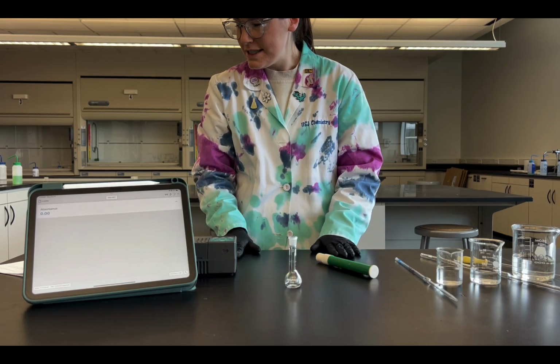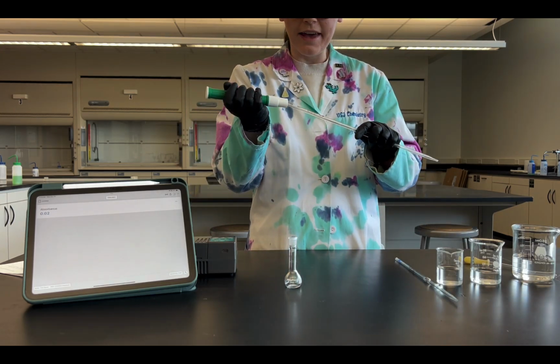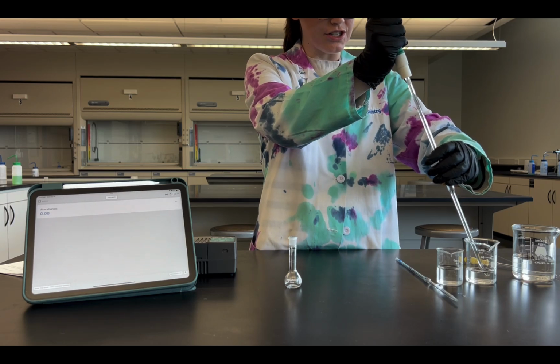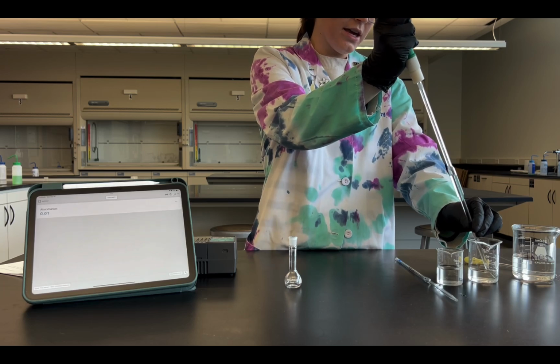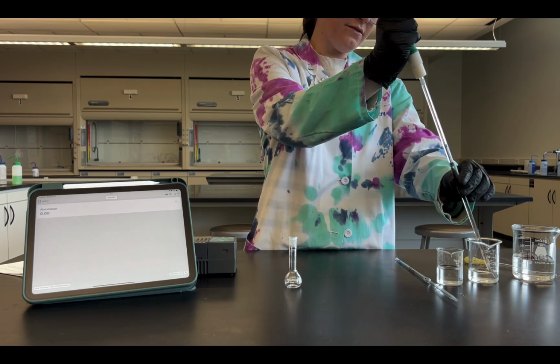So for this dilution, I am using 5 milliliters of a slightly less concentrated iron nitrate, so that's why the solution is no longer orange. It's now clear because the concentration is lower. So I'm using 5 milliliters of this.